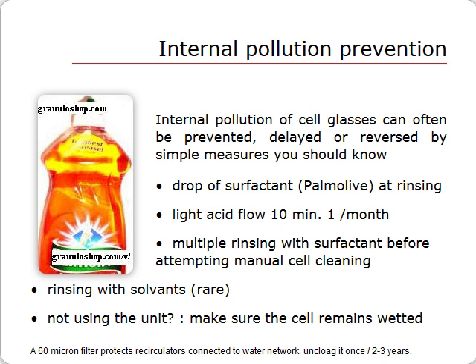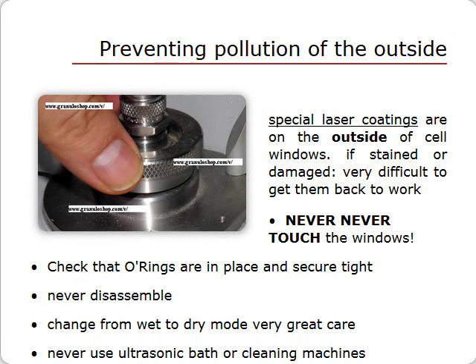Two types of pollution are possible: inside or outside. External pollution is much more of a problem. Remember this: laser protective coatings are deposited on the external surfaces and not on the inside, since inside surfaces come in contact with the potentially abrasive sample. If external surfaces are stained, scratched, or damaged, repairing the cell will be extremely difficult — this will be covered in lesson 3. Never forget: never touch the cell's outside windows, and do not attempt to clean the outside windows yourself.